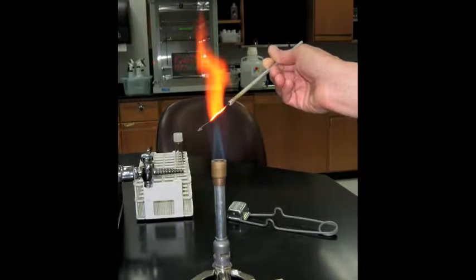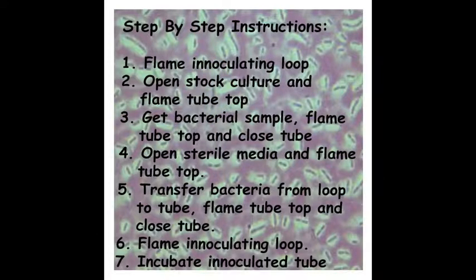Now repeat the flaming procedure to sterilize the loop before setting it down. Okay, let's watch that whole process without my interruptions.